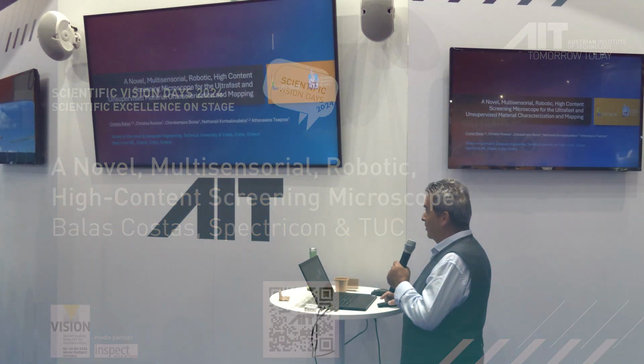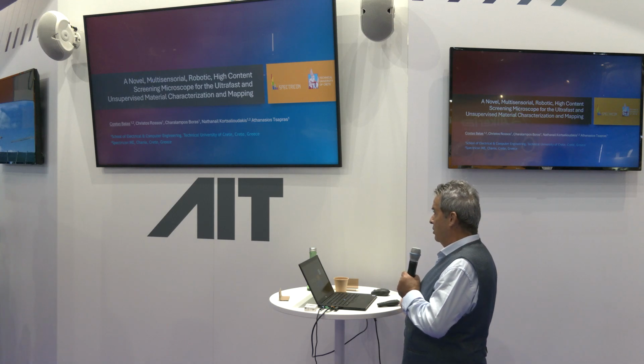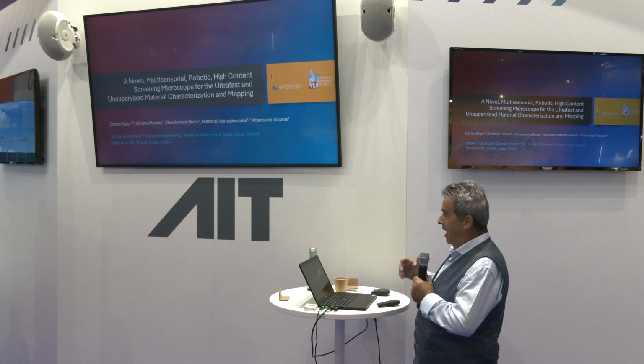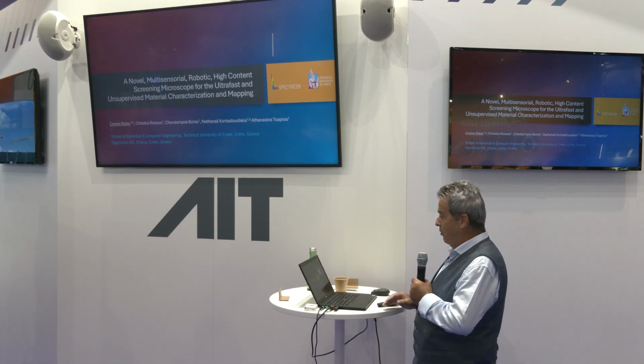Thank you so much. It's a pleasure to be here to present our developments on high throughput screening microscopy. We are developing multisensorial hyperspectral and multimodal microscopes for identifying massive populations of targets in microscopy.